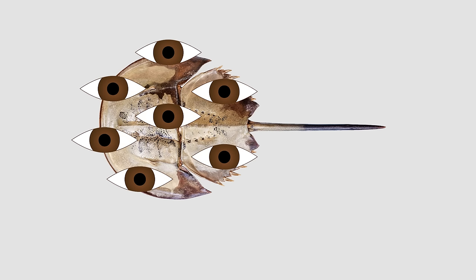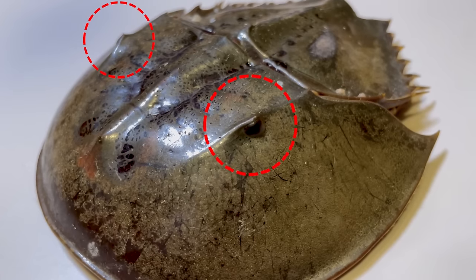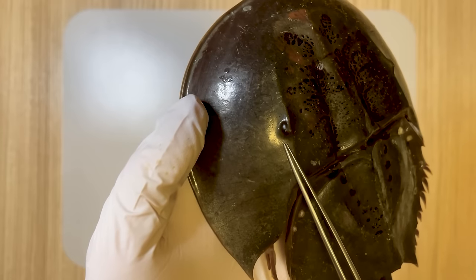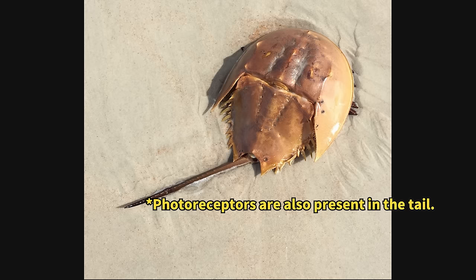The presence of multiple eyes distinguishes horseshoe crabs. They possess a pair of compound eyes, akin to insect eyes, located on the upper left and right sides of the cephalothorax. In addition to these compound eyes, the horseshoe crab features a separate, simple, light-sensing monocular eye designed to detect changes in light.